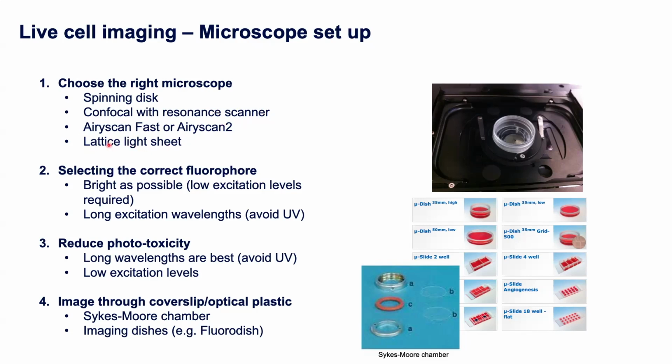Or do you need to go to something like a lattice light sheet system, which is extremely gentle and a very good way of doing, again, long-term live cell experiments, or experiments where your samples are maybe prone to phototoxicity or photobleaching.